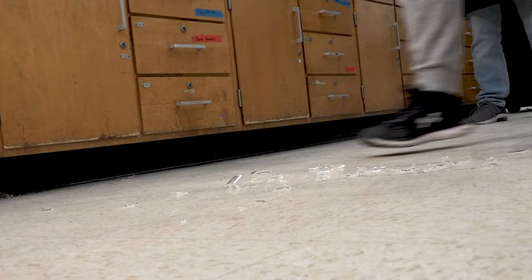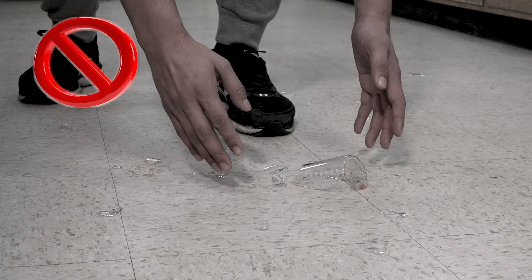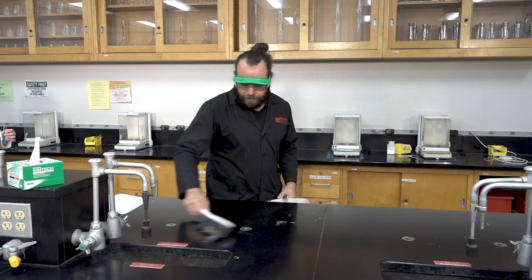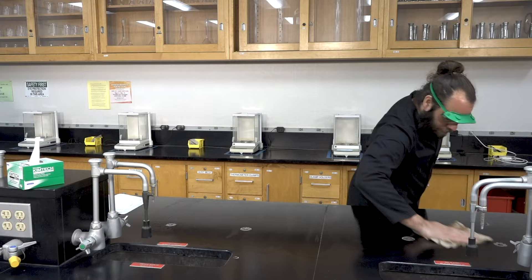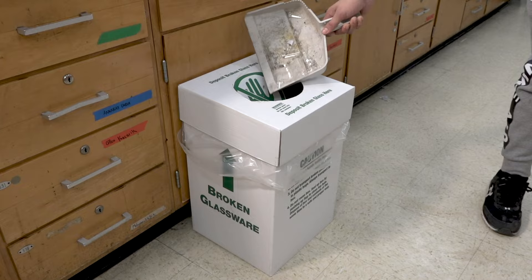In the event you do accidentally break glassware, let your instructor know immediately. A common accident in the lab is cuts from broken glassware. Sometimes when a student breaks a piece of glassware, they get a little embarrassed and try to pick it up quickly with their hands. It's important never to clean up broken glassware with your hands. Always use a dustpan and hand broom, even for the large pieces. As an additional precaution, wipe down the surface with a damp paper towel to remove any small shards of glass that may be hard to see. All broken glassware needs to be placed in the broken glassware container, not in the regular trash where it can pose a hazard to the custodial staff. Importantly, no other trash should be placed in the broken glassware container.